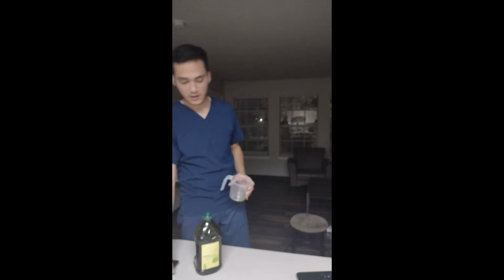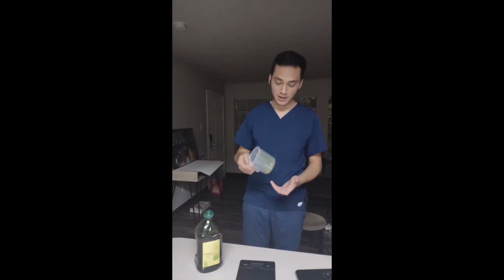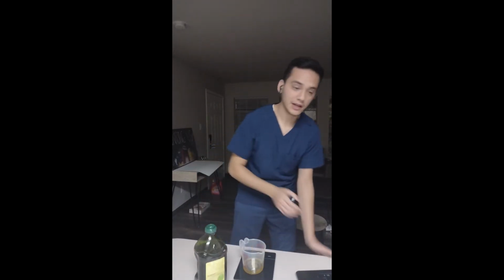First, we have to tare the balance. This means that the balance will start at 0, even though we have the measuring cup on it. So now all we have to do is start adding the volume, and report the mass in our graph.